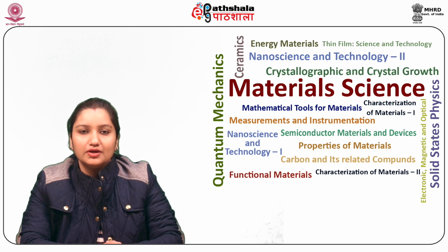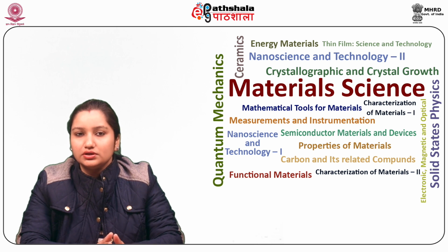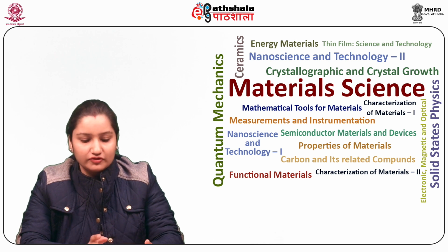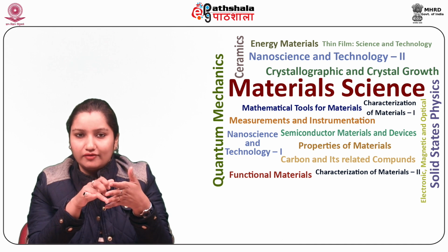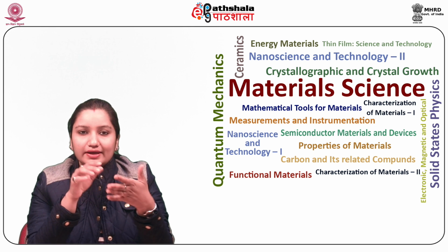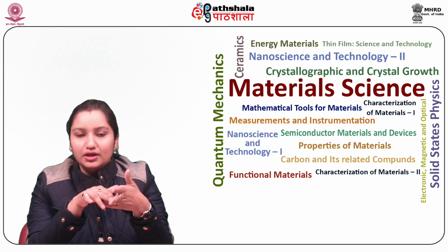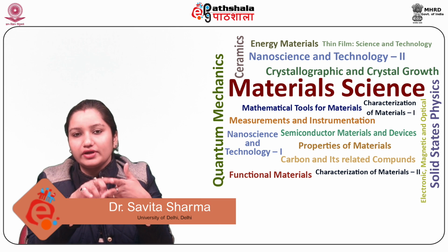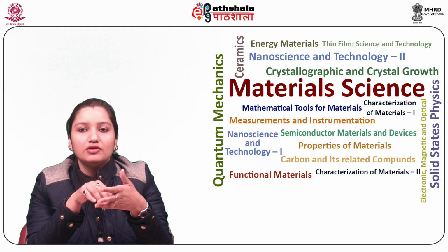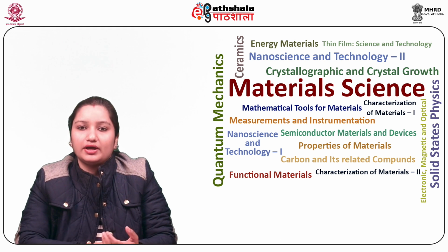So students, let us now summarize what we have learned in this module. First of all, we learned about the principle on which the FTIR works. Secondly, we studied in detail about the instrumentation. We studied in detail about the fundamental components of an FTIR system, and then we took a few examples of polyatomic molecules representing the FTIR graph.